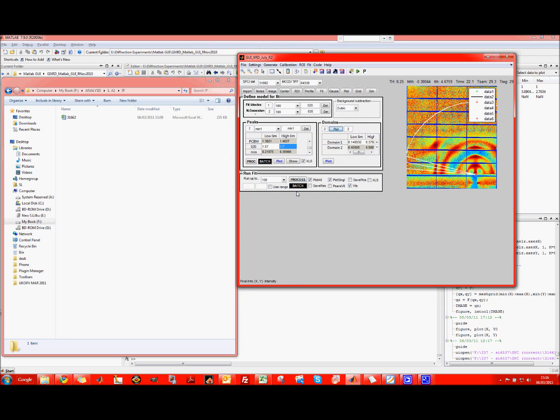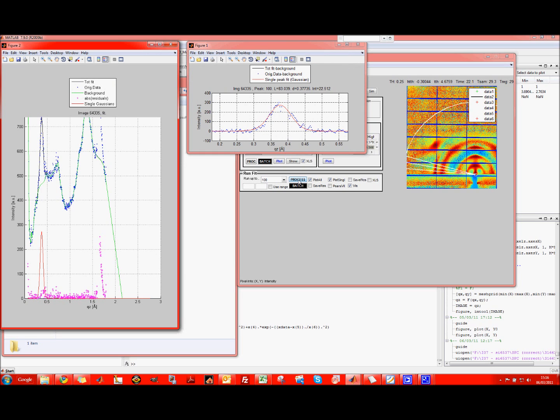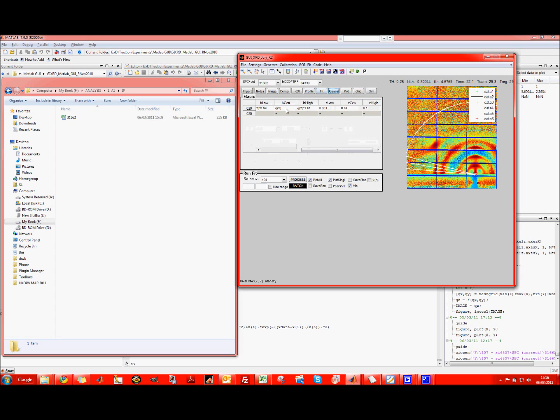Let's see, it's a bit difficult because there is the grid in the middle, but it's okay, not that bad. Clearly with this thing you get just qualitative information. And now we need to work with the second, this one, and this number, pick number 5. So we select this, go to this one, pick 5.